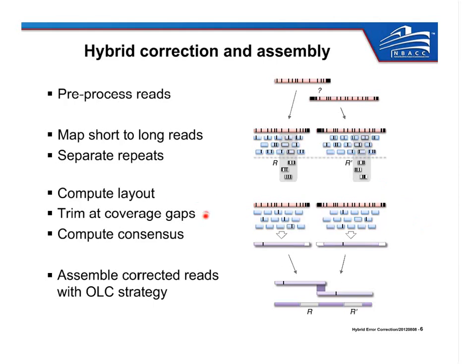And importantly, we trim the coverage. We trim the original PacBio reads anywhere where there's an odd coverage gap. This means where there's a position in the PacBio read that has no Illumina reads overlapping it. This is an important step for us because the PacBio chemistry uses hairpin adapters on the end of its molecules that it puts into the individual sequencing wells. The polymerase can read around that molecule multiple times, and this results in what looks like a chimeric read, because you're reading the forward strand, you go around the hairpin, and then you're reading the reverse strand.